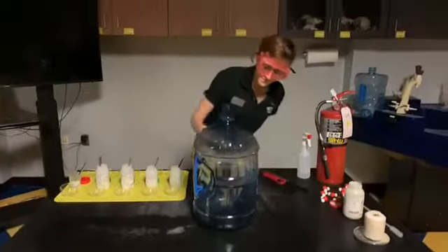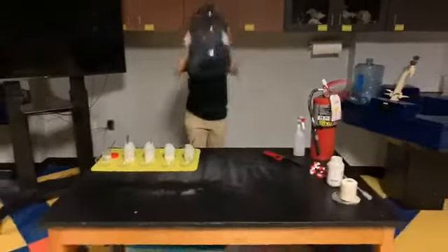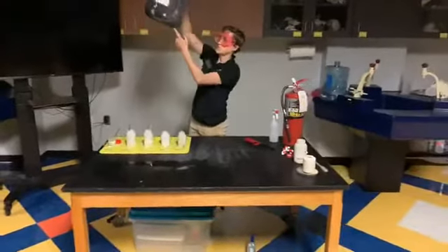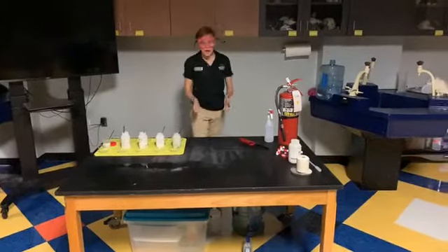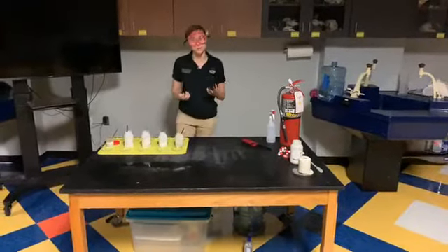Awesome. Cool. So again, ran out of oxygen. We still have plenty of fuel in the bottom. And a combustion reaction is one type of chemical change.